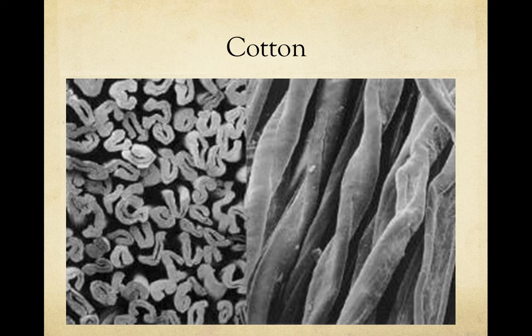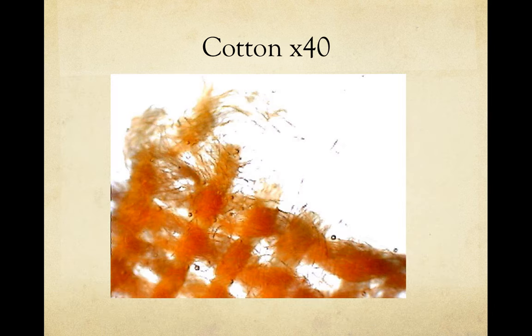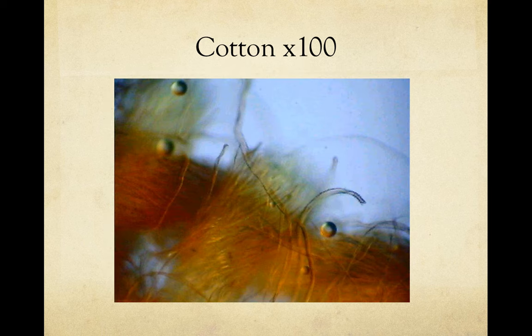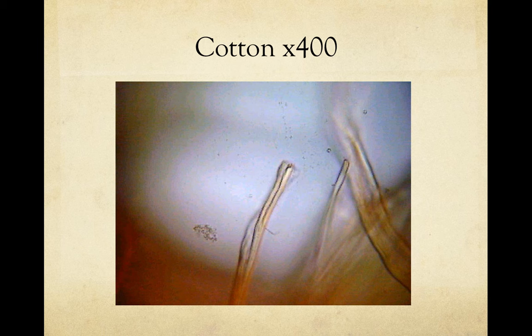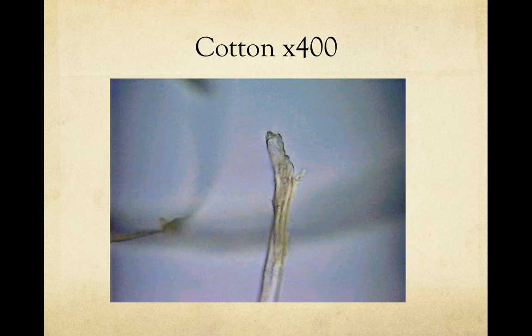Here is cotton again under SEM, and also under general microscopic imagery with increasing magnification. You can start to see some of the twisting. Notice that no two cotton strands look quite alike, even though they share a similar form.